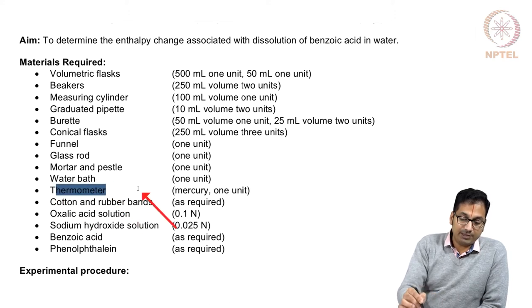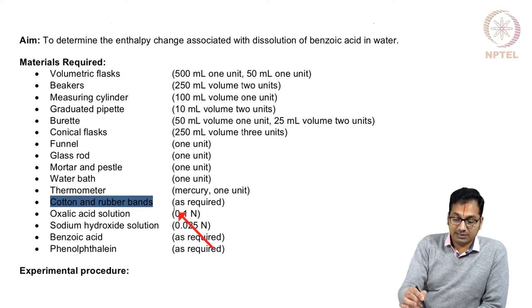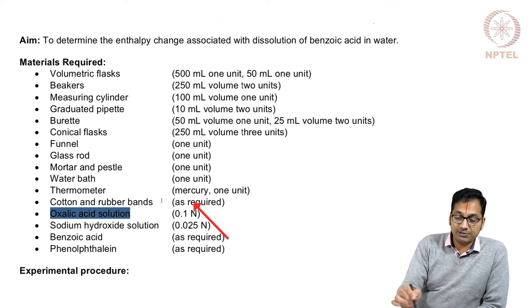Of course, a thermometer to measure the temperature. You will understand why we have to use cotton to make sure no solids come up when you are making a measurement. You would be using oxalic acid.